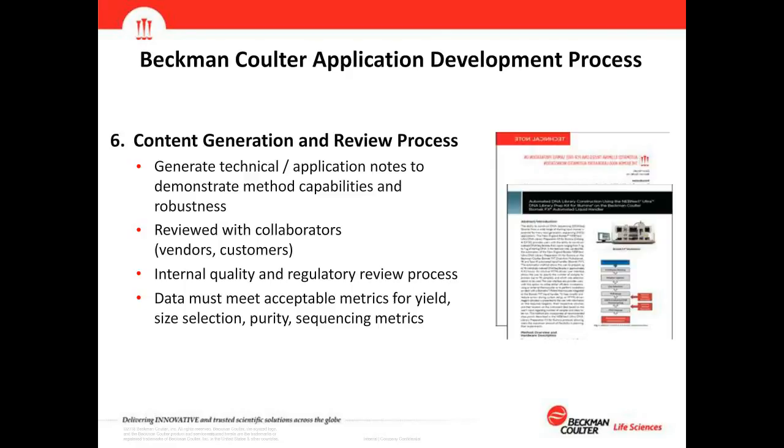The other thing we look for is evidence of cross-contamination. So our NGS methods are working with all open plates typically, which helps speed the workflow along because then you're not having to seal and unseal plates. But we do realize that this represents a risk for cross-contamination. So it's something we're looking for in the sequencing data.